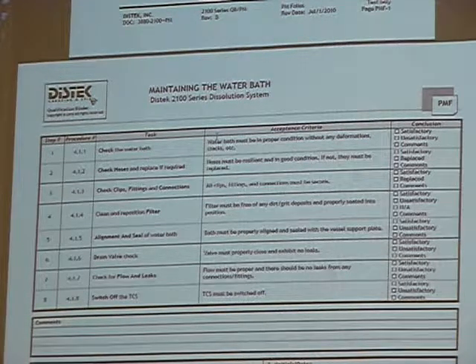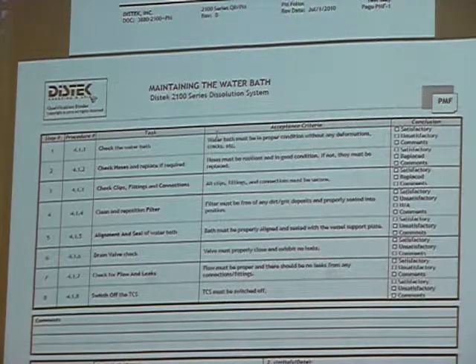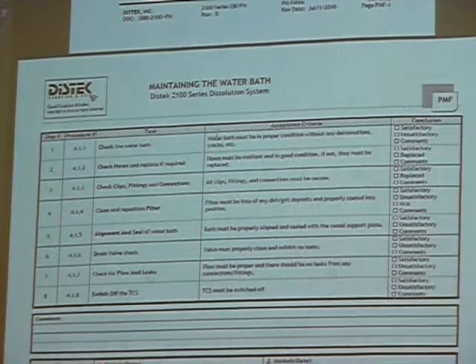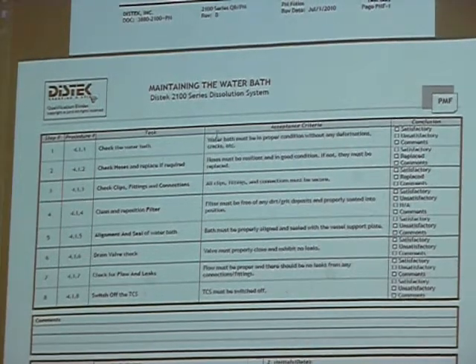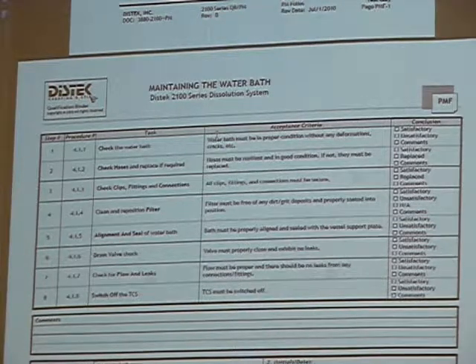They tend to, as they get older, the 2100s, with 37 degree water having run through it over the ages, tend to get a little bit warped, meaning they're more pliable in the middle. And there's a clip in the back and a clip in the front, and if it's not being held together, it could actually slip out of the clip and start getting a little bit wider.